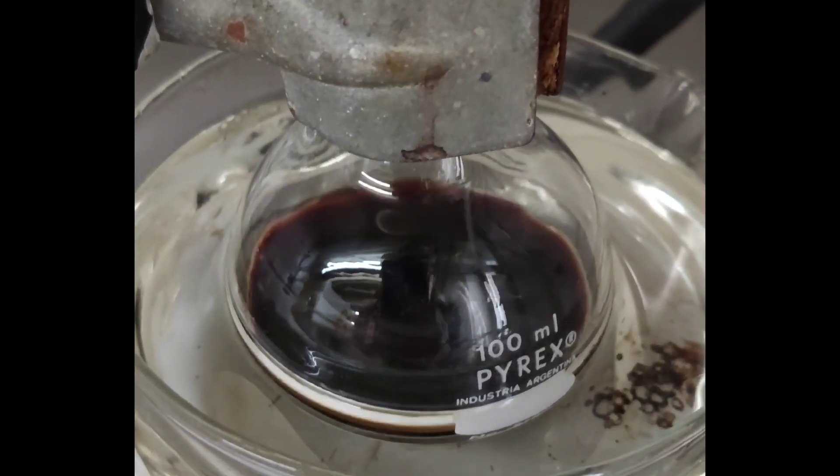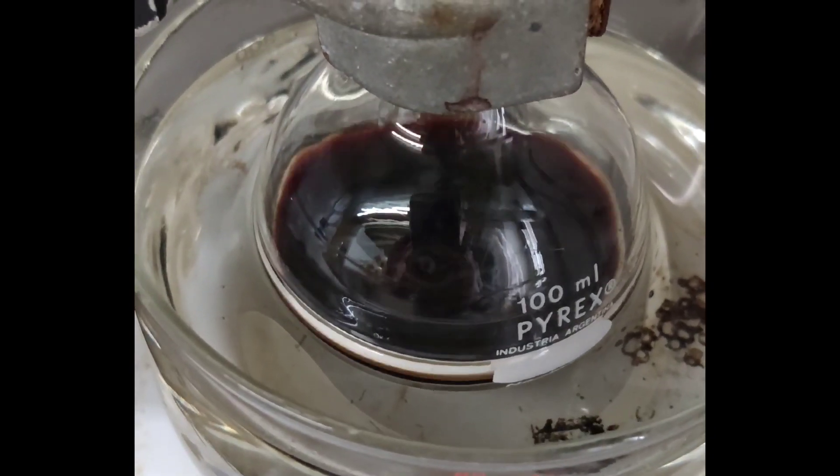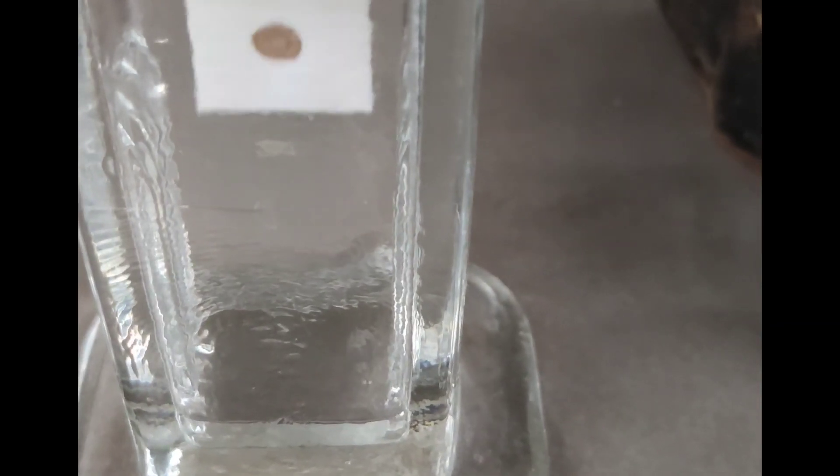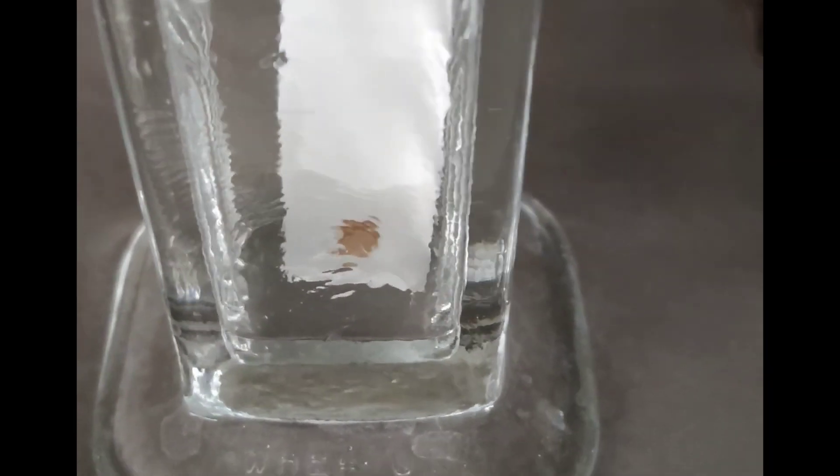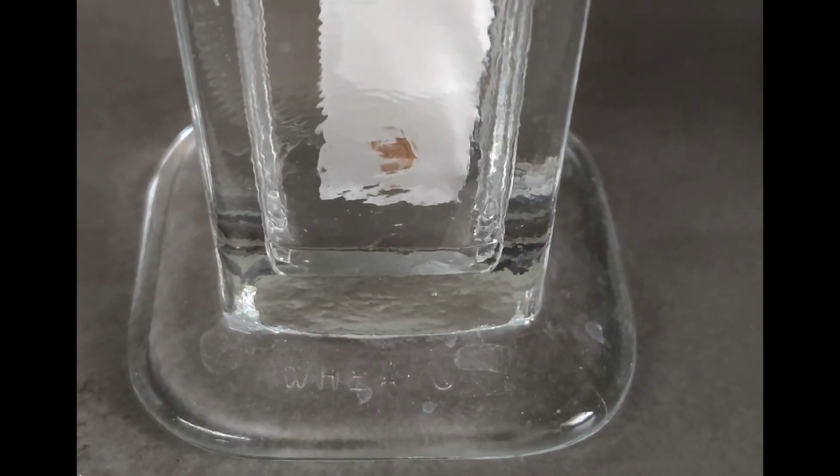The reaction mixture has a more reddish color. We check the reaction by TLC running in three parts hexane one part DCM. We have only one spot. The smear is due to the DMSO in the sample.